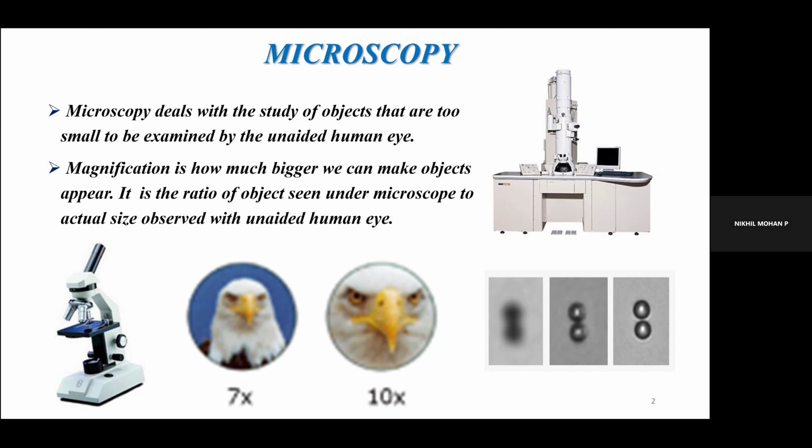Okay, so before going to the microscopic technique like electron microscopy, we should familiarize ourselves with the terms that we commonly use in microscopy. First thing is magnification. So what is magnification? Magnification just zooms in or enlarges an image of what we visualize using a microscope. So magnification is how many times we magnify an object. A 1 micrometer particle, in the magnification limit of an optical microscope, is 1,000 times. But in an electron microscope, it's about 1.5 lakh times. So if you magnify one image 100 times, then the magnification is 100x.